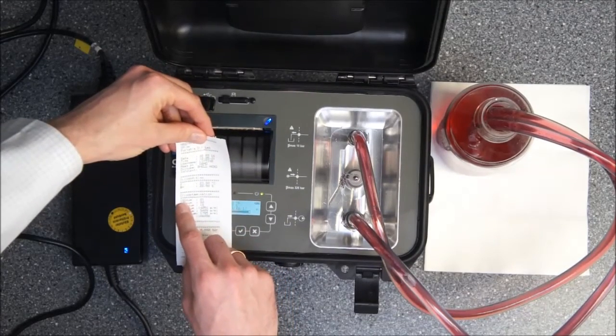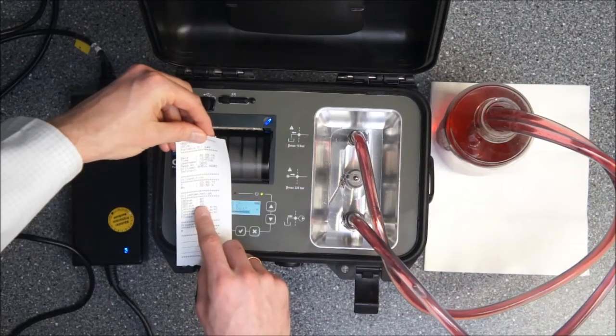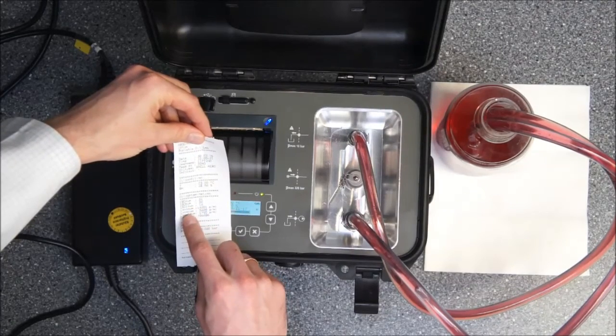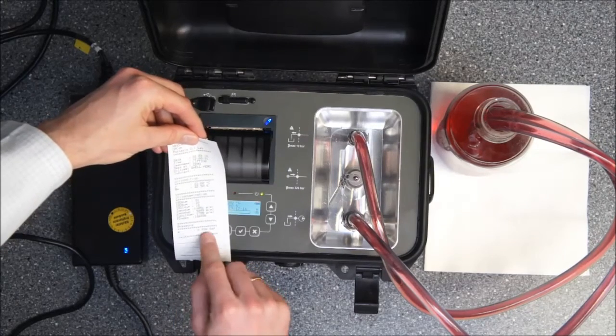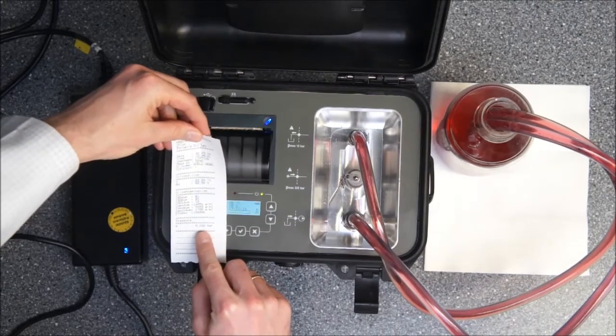Next is the oil contamination. There we have the ISO readings in the ISO classes and also the particle countings that we have measured. Last but not least you see the measurement of the pressure at the bottom.